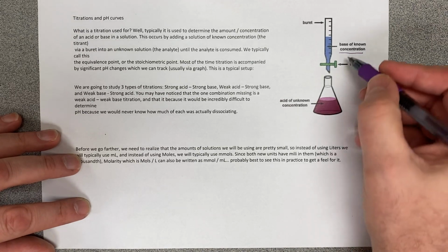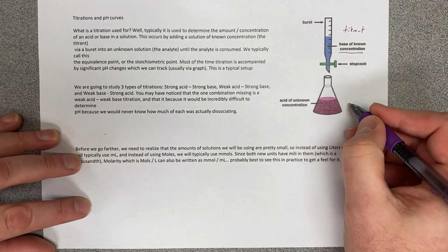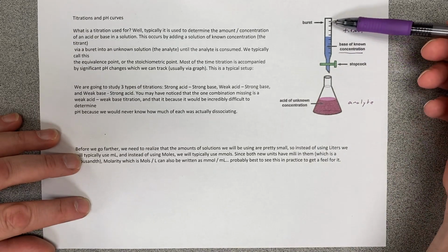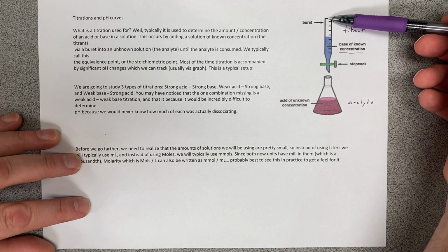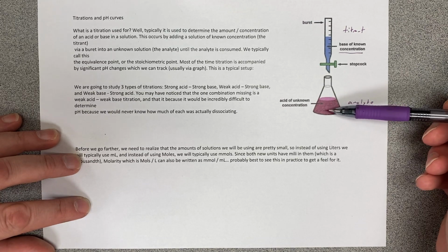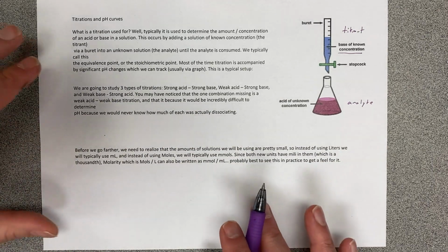We call the thing that we're adding in the titrant, and the thing that we are trying to figure out the concentration of, we call the analyte. Essentially, this is a burette, and we fill it up with a certain amount of known concentration, and we drop it down into here until we use up all of the analyte. When we get to that point, we call that an equivalence point or a stoichiometric point, which we'll talk about in a little bit. And the way we usually track this is via a graph.